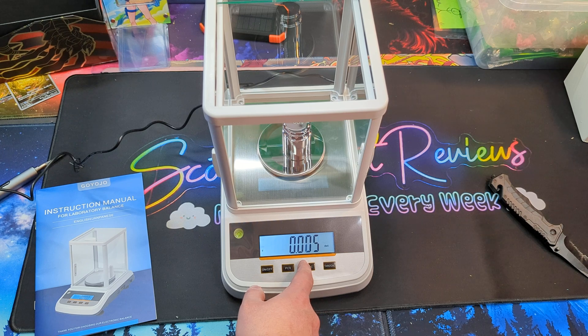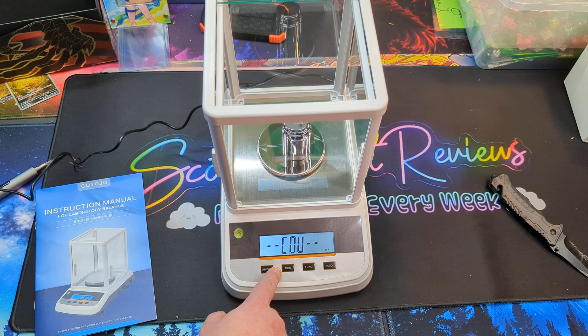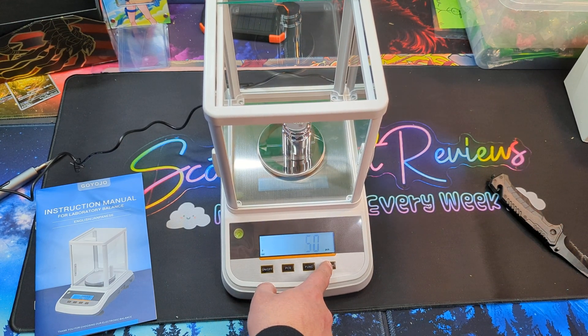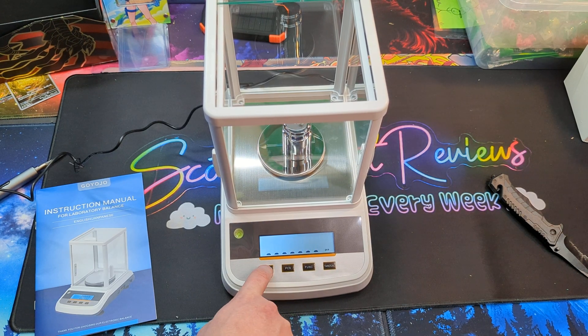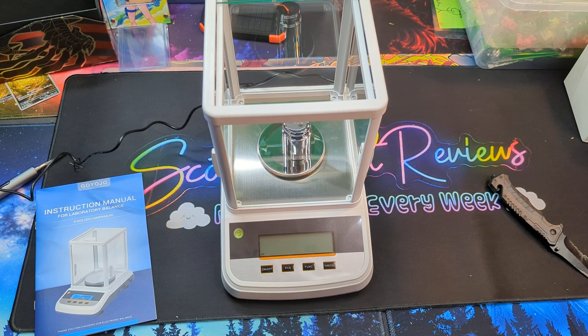Mo, dwt, ounce, oz, pounds, lb, tl, t oz, t — and I believe percentage — and back to grams. You can also change the quantity. Overall, very nice.